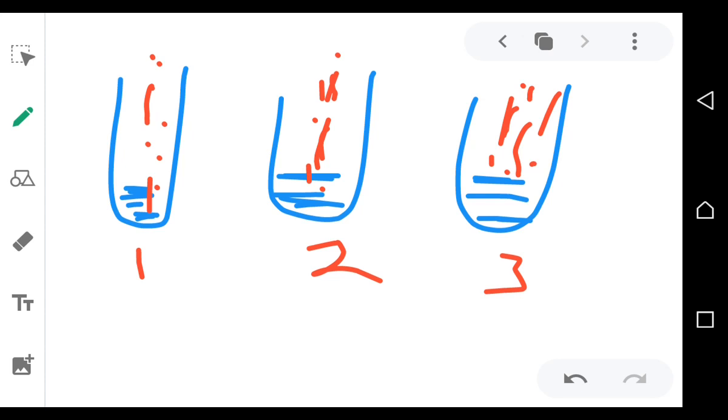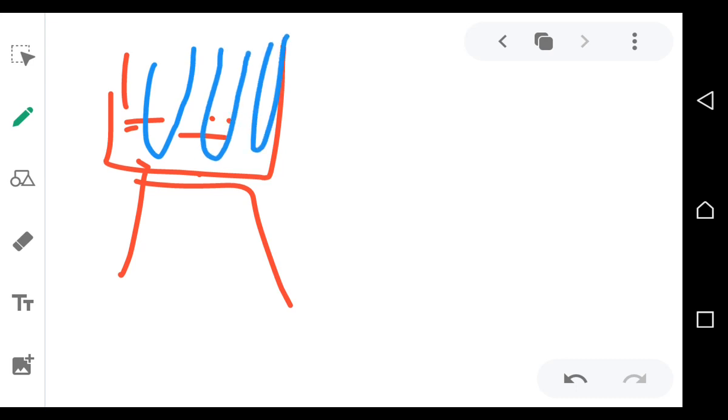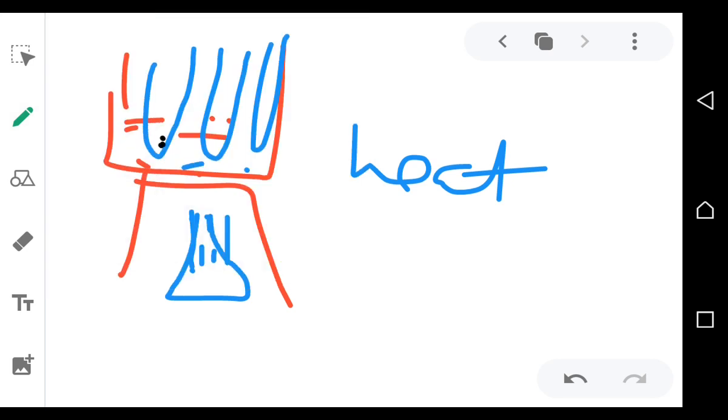When you finish shaking them, you go where there is a source of heat. There's a Bunsen burner there, and a beaker filled with water. So you take your 3 test tubes, 1 for water, 1 for glucose, 1 for sugar, and you boil them with heat. That's a Bunsen burner heating the water in the beaker, and the test tubes with the different substances are in there.